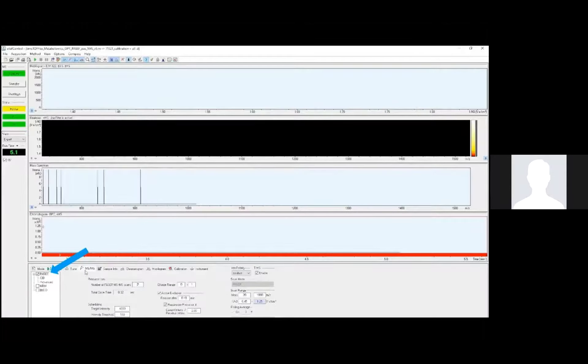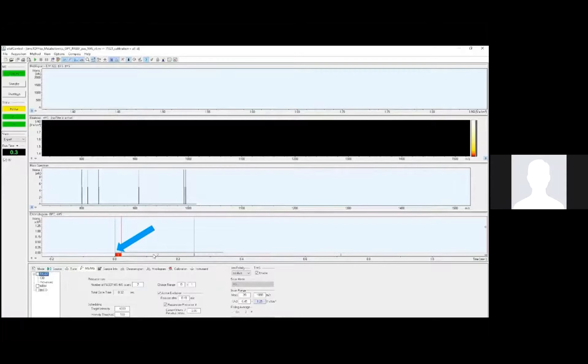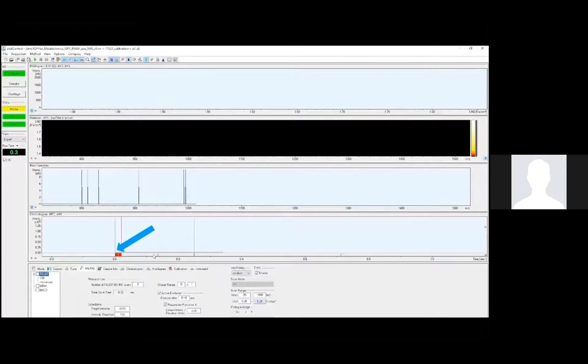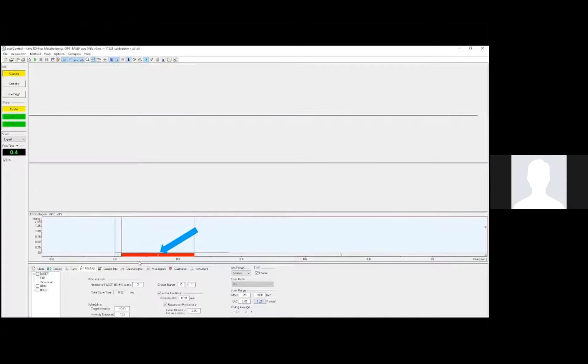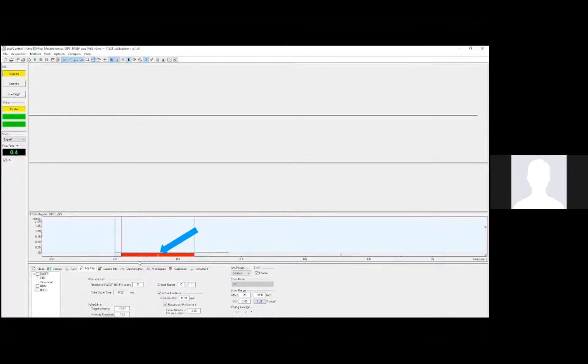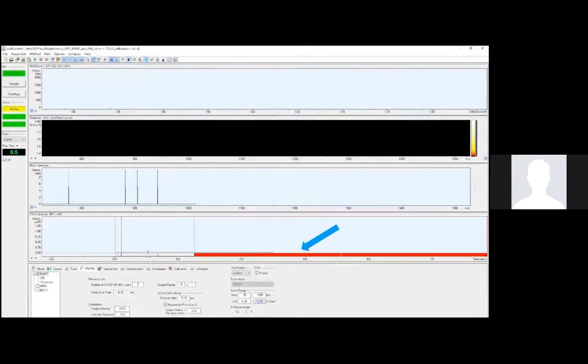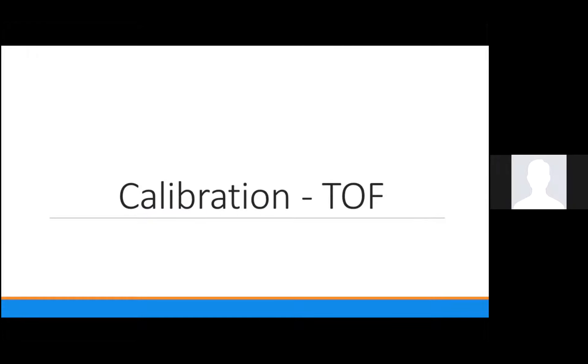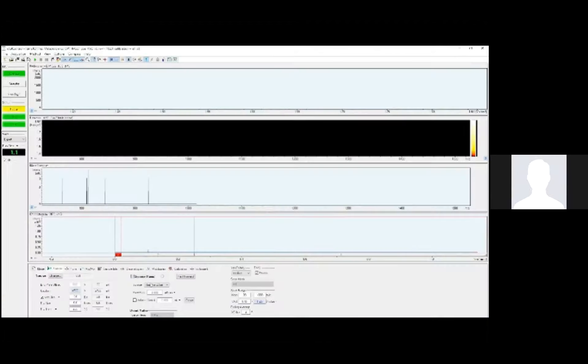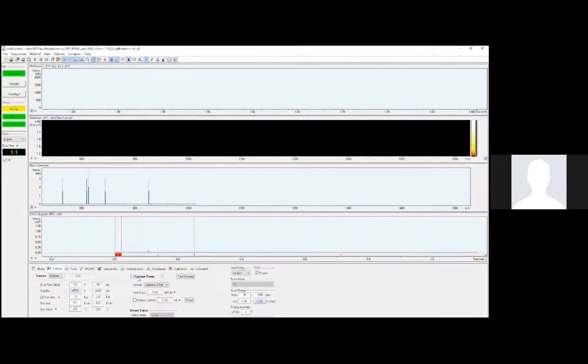These MSMS settings allow us to turn PASEF on or off. I want to take this time to point out the segments in our method here. You can see in segment one, PASEF is turned off. In segment two, PASEF is also off. This is the calibration segment where the switching valve turns on. Segment three is then the sample acquisition segment. It's here that we have PASEF turned on to fragment ions from the LC.